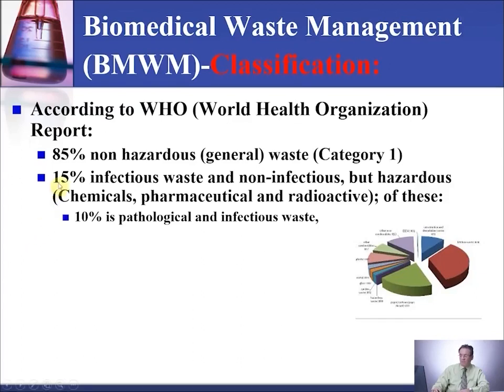But what happens if we mix this 15% with the 85%? Then 100% will be contaminated and need to be dealt with as contaminated and then need to be treated. That's why it's very important to separate general waste from infectious waste.